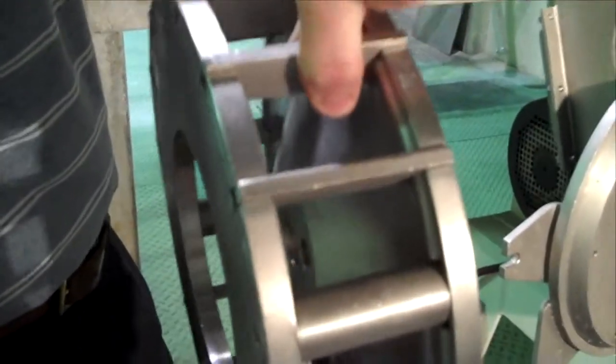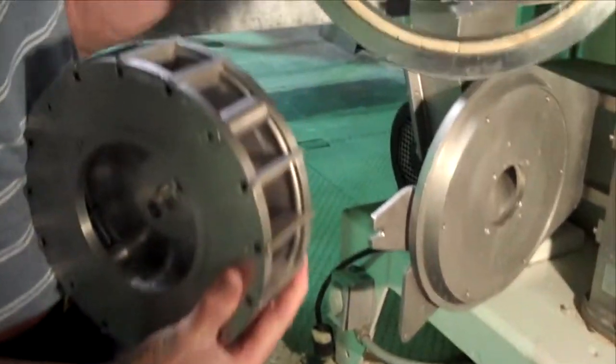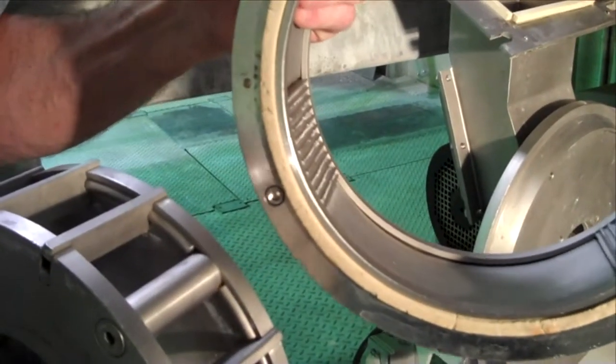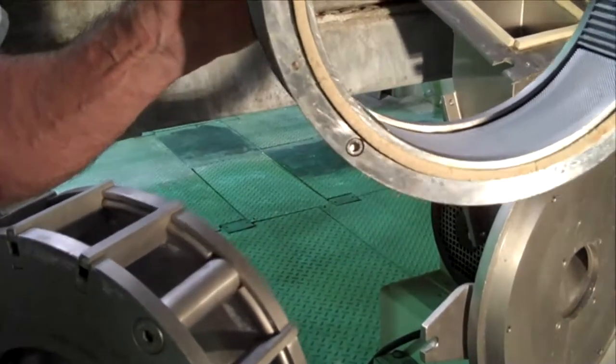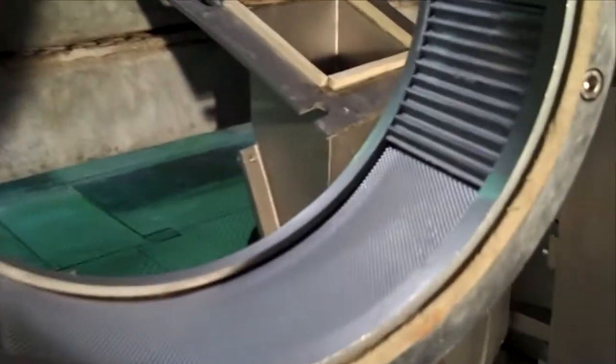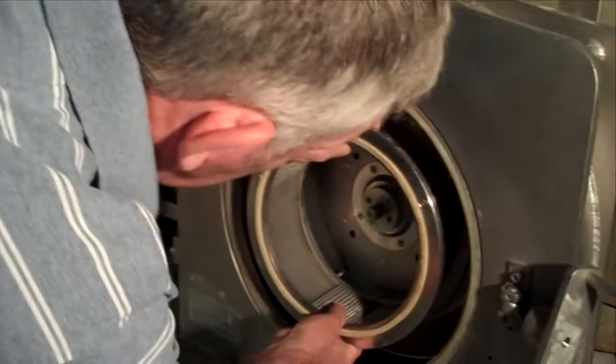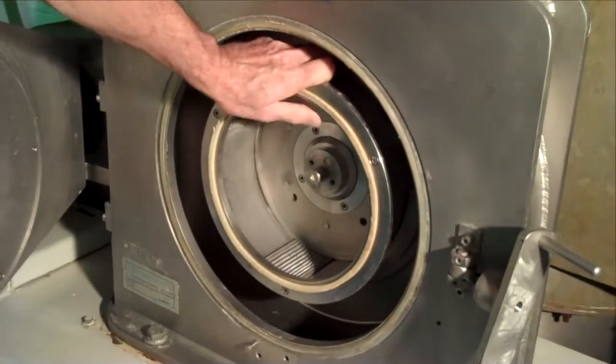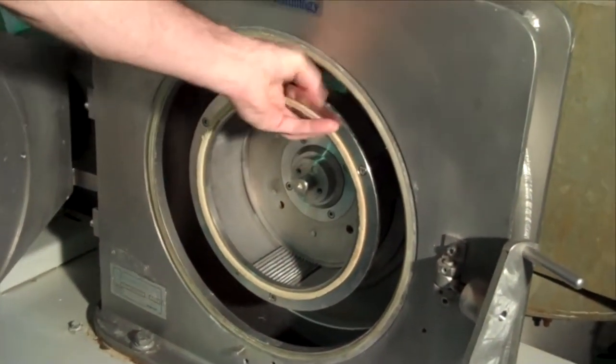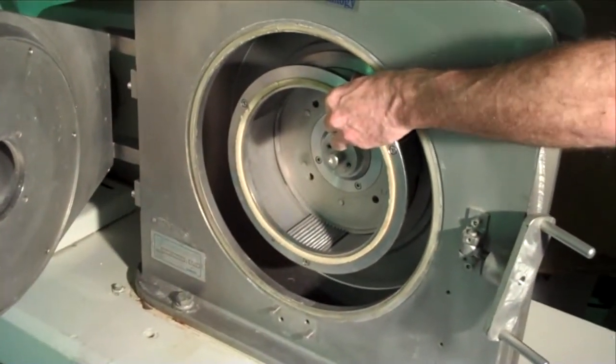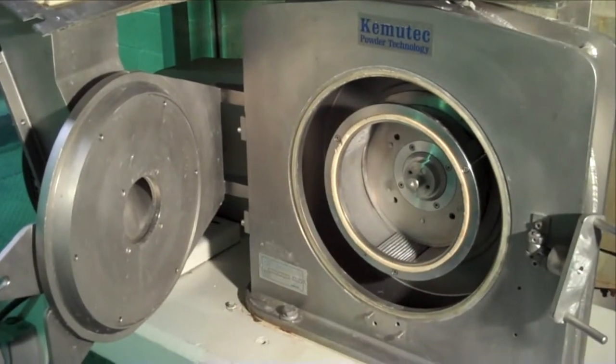The outer screen assembly shown here is stationary and provides a degree of classification and additional cutting with the inset cutter blocks. Fitting the screen assembly is a simple case of mounting it onto the back wall of the mill and fastening from behind. With the screen assembly in place, we can now fit the rotor which is simply mounted straight onto the drive shaft.